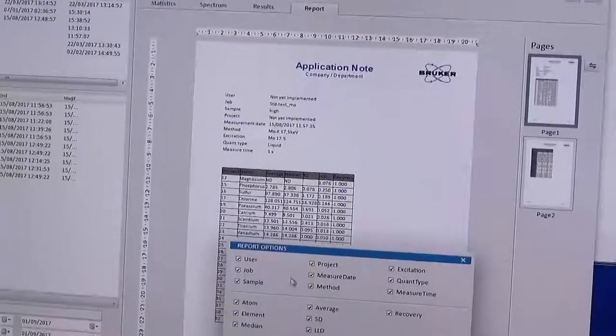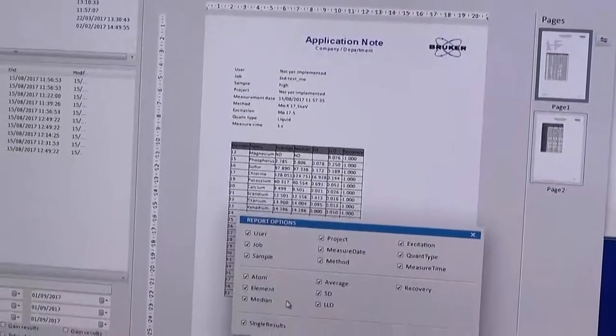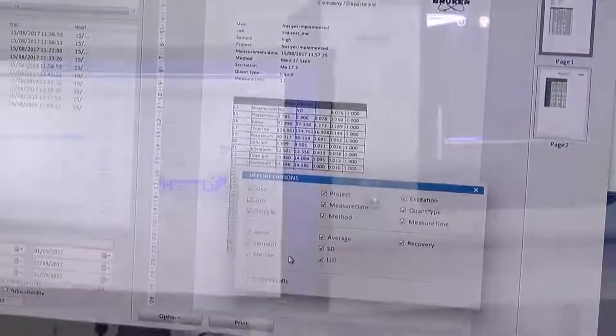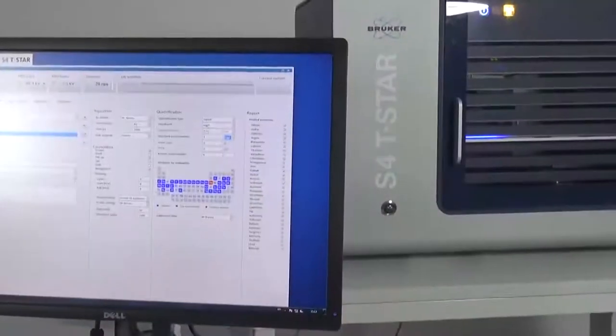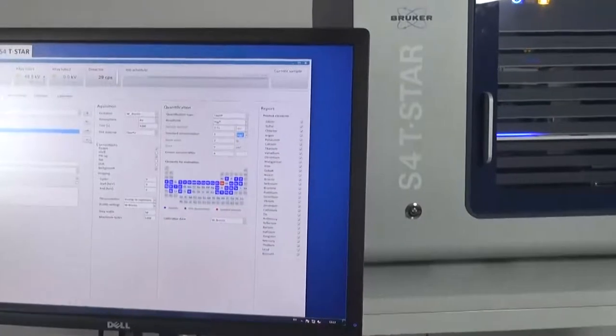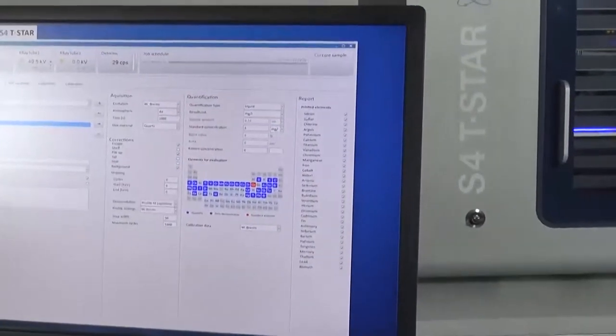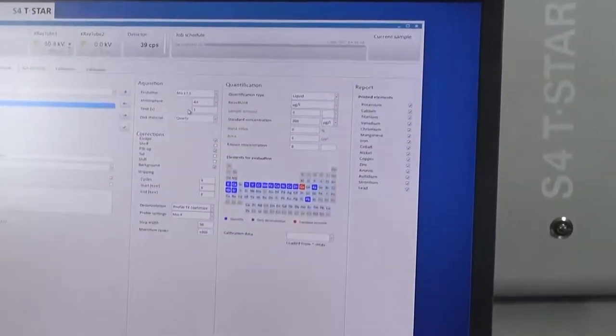For quality control, the software also allows the definition of crucial thresholds or confidence limits and provides warnings if critical limits are exceeded.